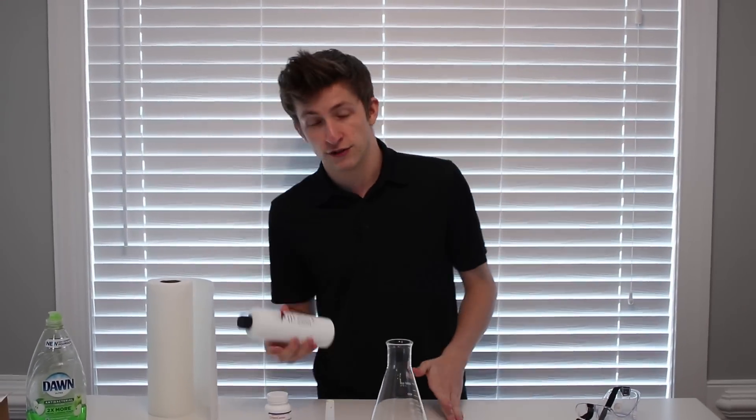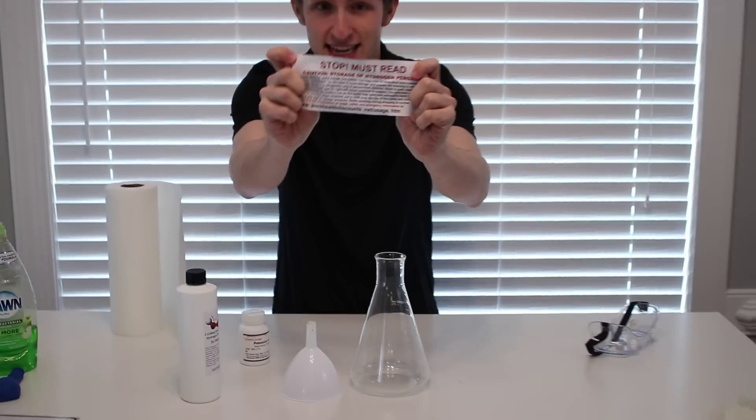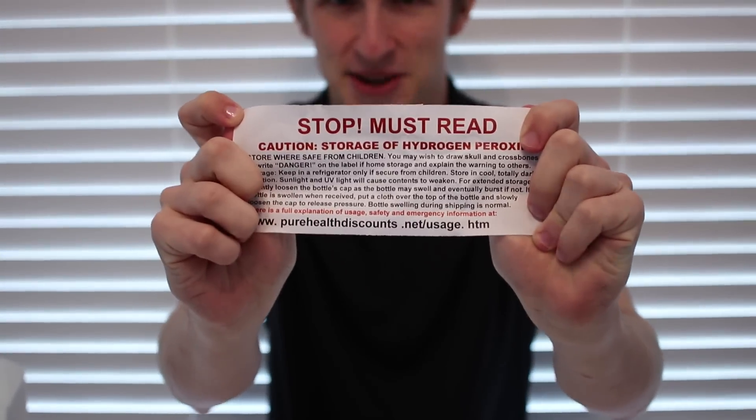Most of you guys probably have hydrogen peroxide at your house, but this isn't just any hydrogen peroxide. This is certified food grade hydrogen peroxide, a very pure concentration. This has 12% of H2O2. And so this stuff is very not safe. Normal hydrogen peroxide is fine, this stuff is not. We got it shipped to us and it comes with this warning label right here, guys.